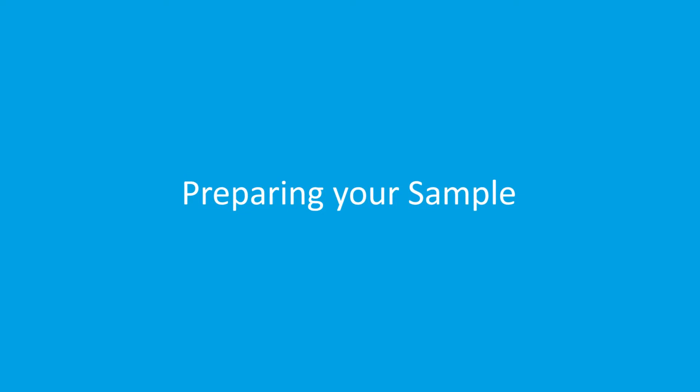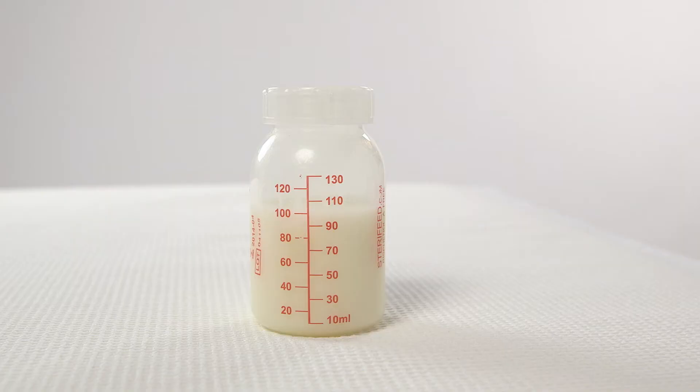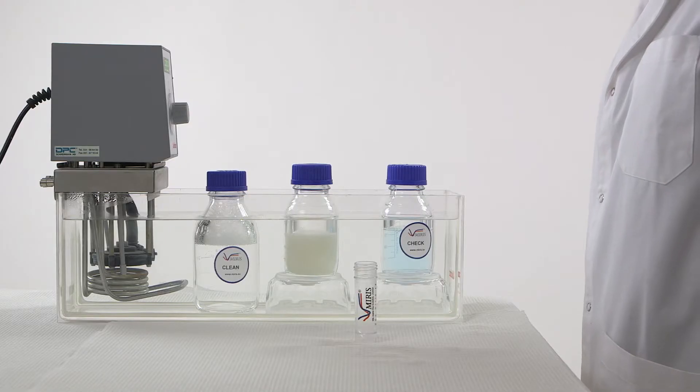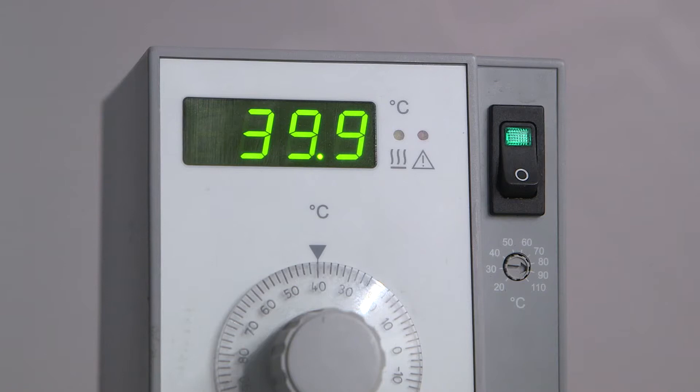All samples must be correctly prepared to give accurate and reliable results. When analyzing frozen milk, it should be thawed slowly in a fridge to prevent damaging the samples. A water bath can be used as long as the temperature does not exceed 40 degrees Celsius.